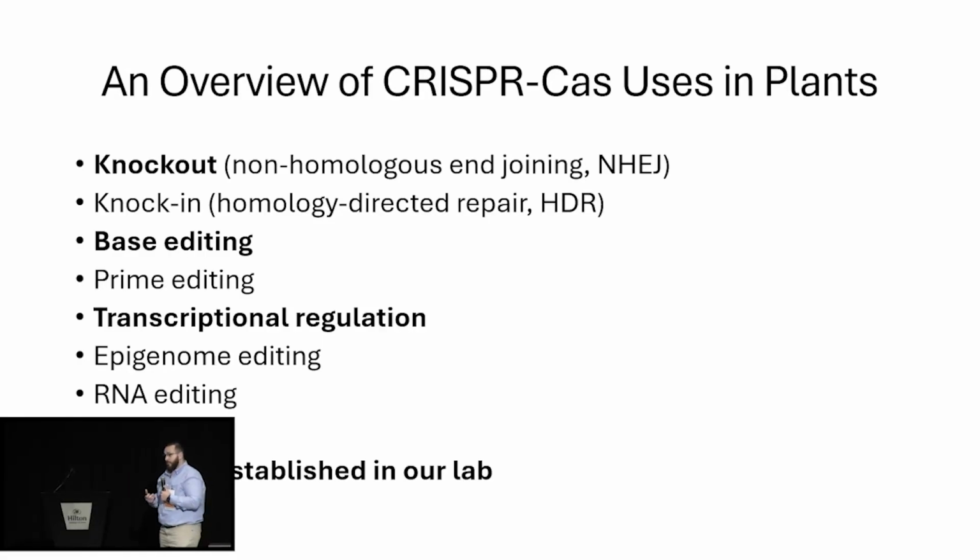We can perform transcriptional regulation to control gene expression. We can modify the epigenome of plants using CRISPR as well, and we can also do RNA editing. So the bolded letters are what we particularly work on, what are very well established in our lab. So knocking genes out with CRISPR tools, base editing tools, as well as tools for transcriptional regulation.